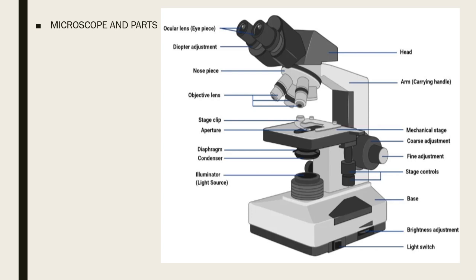Okay, and then you have your test tube and test tube rack, of course. You are utilizing your test tubes for centrifugation purposes, also for centrifuging. And then for your dropper, or your Pasteur pipette, of course you are utilizing such to transfer samples. If you need to put a drop of a sample on a glass slide, as such.